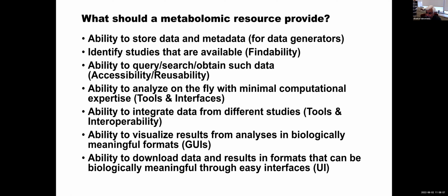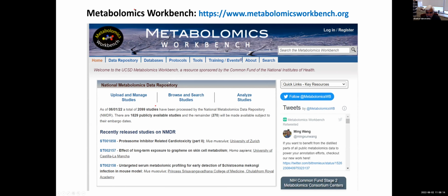I'm going to wear the lens of a biomedical researcher today and walk you through what we have developed over the last 10 years. So, as all of you know, this is the NMDR Metabolomics Workbench. As of yesterday, there were 2,099 studies that have been processed by NMDR. 1,829 are publicly available studies, and the remainder will be made available when the embargo status is lifted. And this is as of yesterday. So you can see that we really continue to grow dramatically, rapidly. I think Owen mentioned a similar number yesterday. It was a few less. And so this is really where we are.